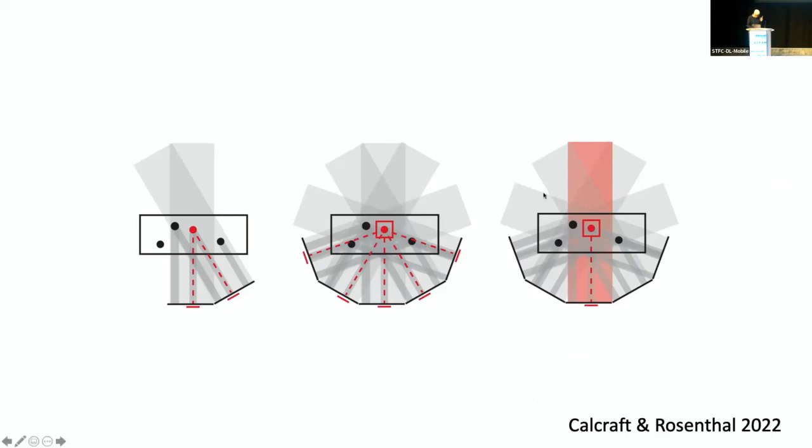And this last picture connects with one of the experiments Tim Grant was describing, the idea that there's an incredible amount of even cellular information in a 2D image of a cellular specimen, and that you can match particles against that. One of the ideas they expressed, and we're trying to convey here, is that because the noise properties will be different in single images versus in these tomograms, there are new opportunities for simultaneously validating what comes out of these more complex data collection strategies.